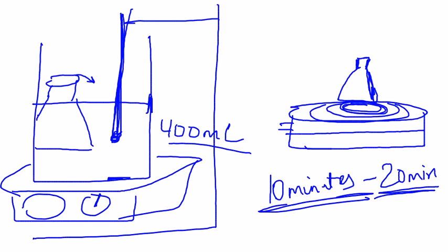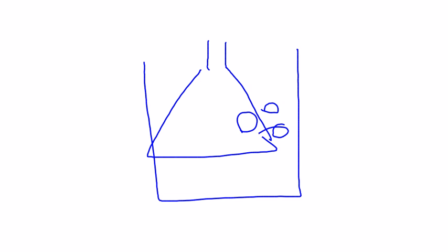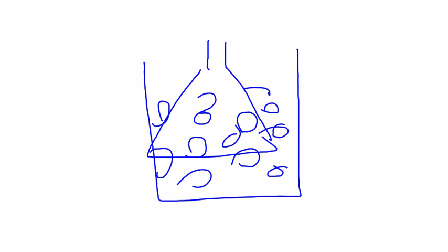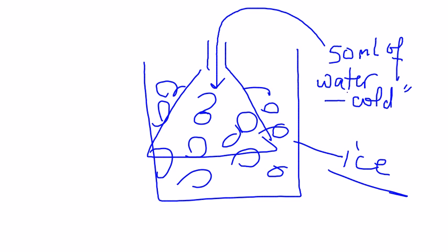As the crystal formation occurs and gets completed, you can tell, because you would start with a clear colorless liquid and a solid would have appeared. While it is still cooling in the ice bath, let's see what that looks like. You will have your ice bath, you will have your flask, and your ice. Okay, it's completely submerged. So while it's still cooling, I want you to add 50 milliliters of water, and I want it to be as cold as possible, so cold water.